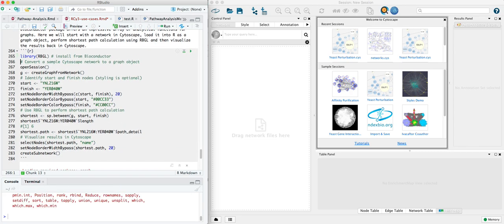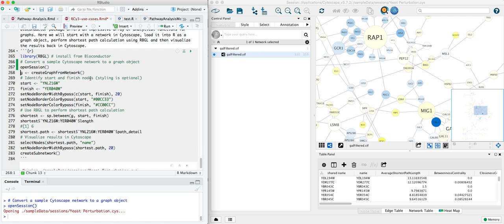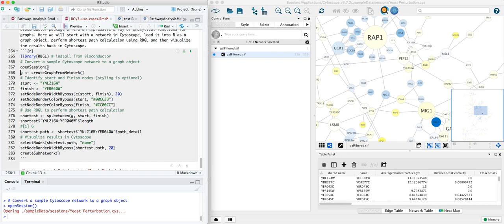Here we'll make sure it's loaded and we're going to begin by opening the sample session in Cytoscape. It's the yeast perturbation network. Open session with no arguments will by default open that sample session, and next we're going to create a graph.